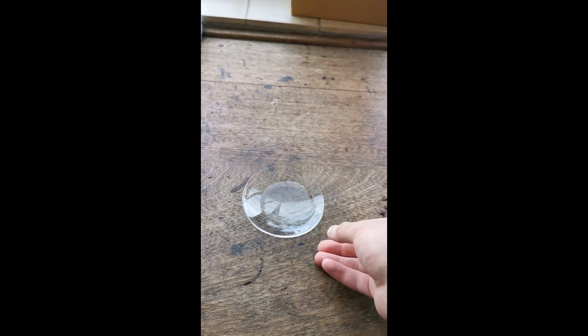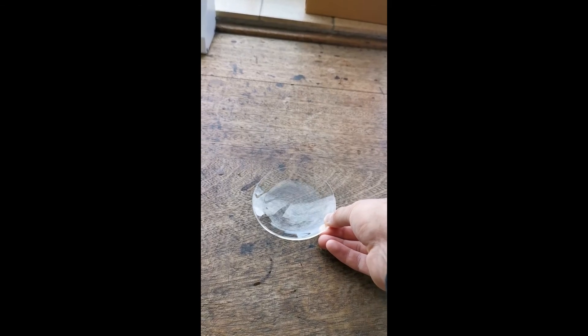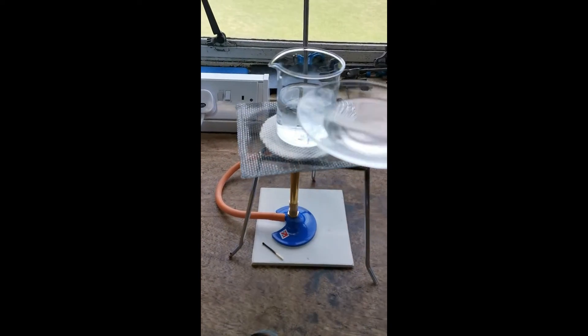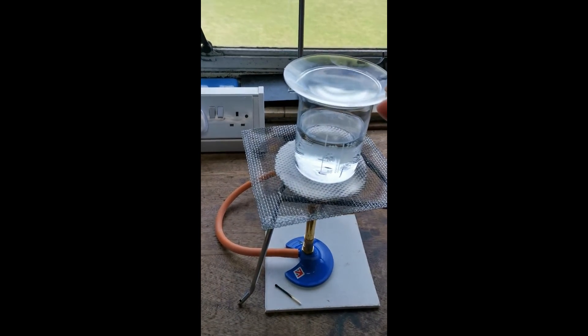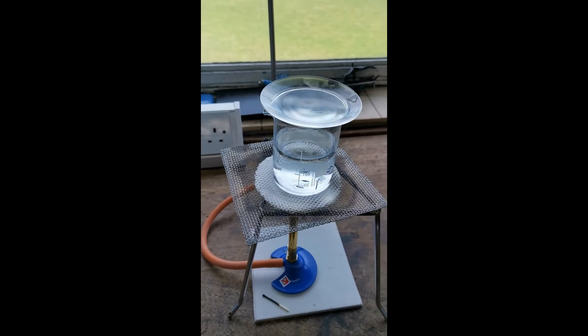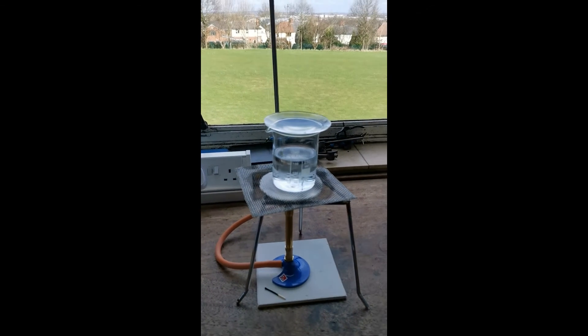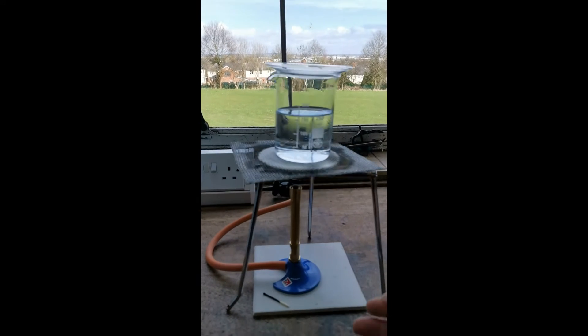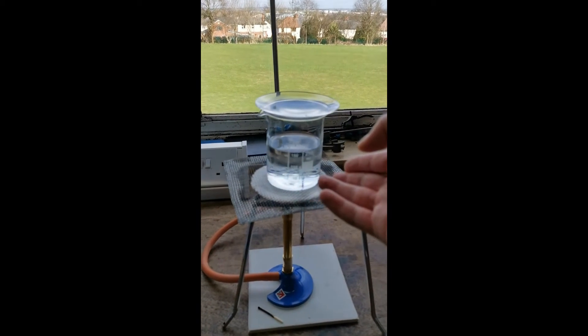We're going to pour about half of it in there, and then we're going to take this mixture on the watch glass and put it on top of a water bath — very carefully. A water bath is a beaker of water that's going to be heated by the Bunsen burner until it boils.